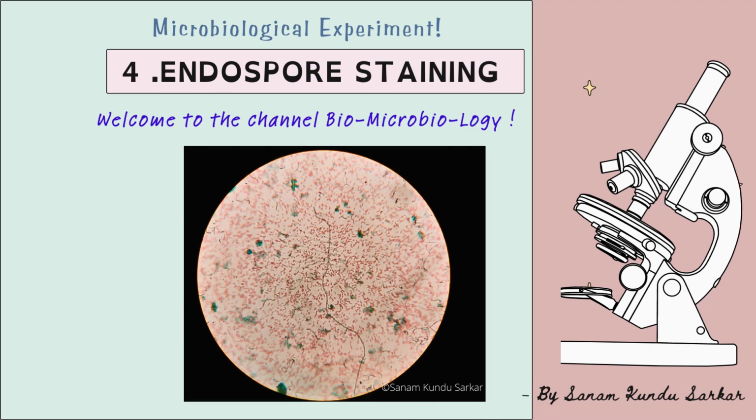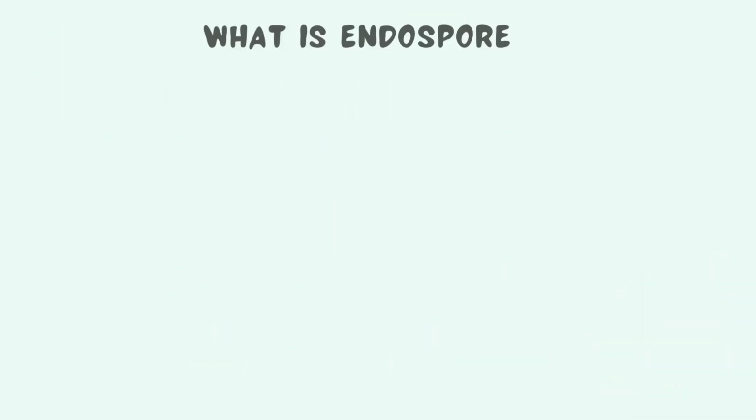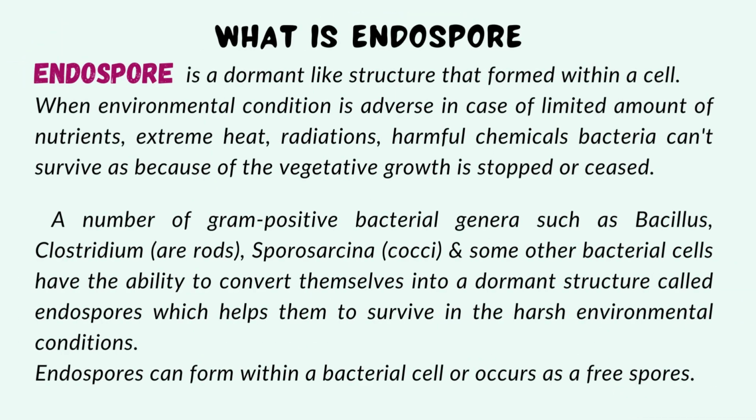I am here again with a new topic, endospore staining, the most common microbiological experiment. In this video, we are going to discuss various things about endospore staining, like what is an endospore and its structures, examples of endospore forming bacteria, types of spores, then principal applications and procedures of endospore staining, and how dyes act on endospores. Now, what is an endospore?